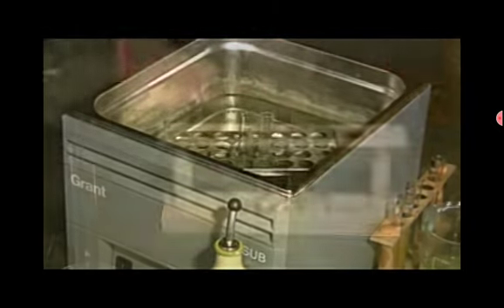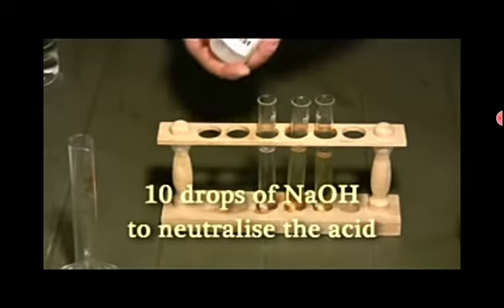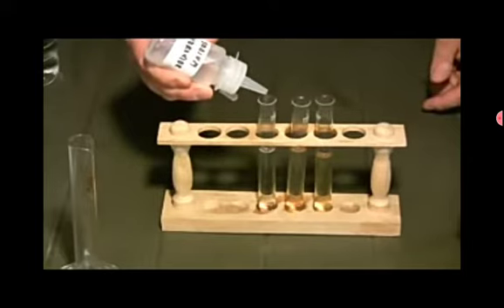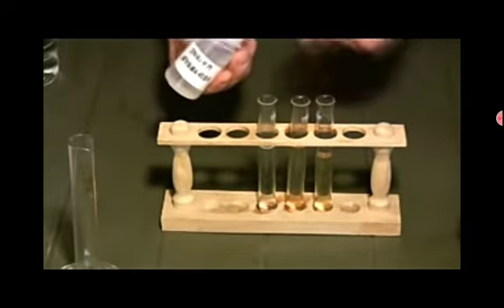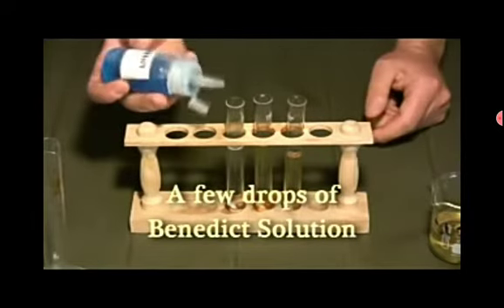You put your 2 test tubes, test control and the sucrose solution, in the water bath for a few minutes. While they're cooling down, you have to neutralize the hydrochloric acid, so you need to add a few drops of sodium hydroxide. Then again, you don't touch that one here. Now it's time to add the Benedict solution. Add a few drops in each test tube.